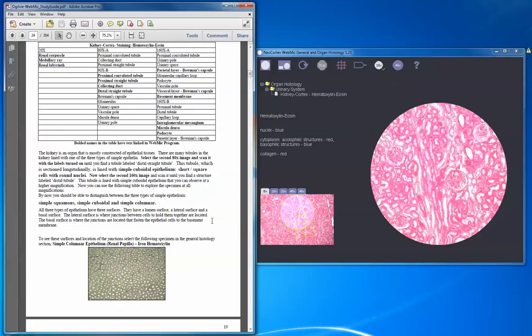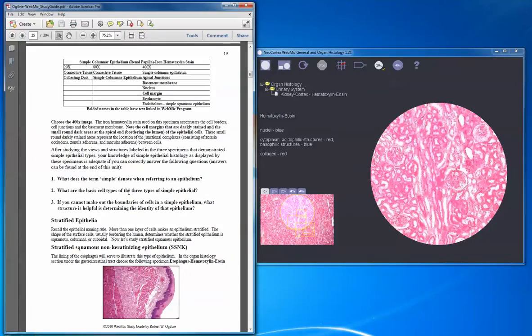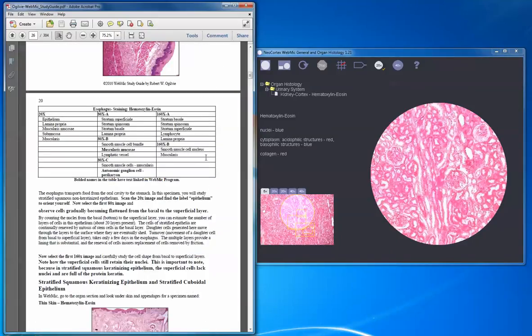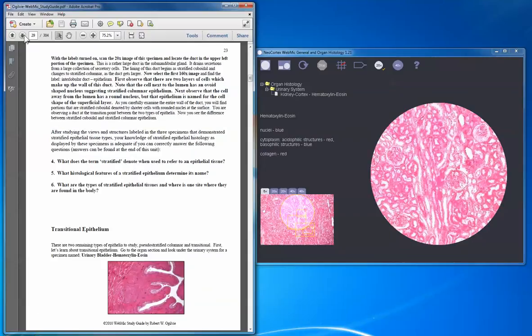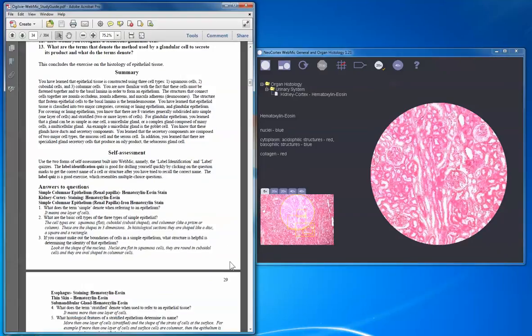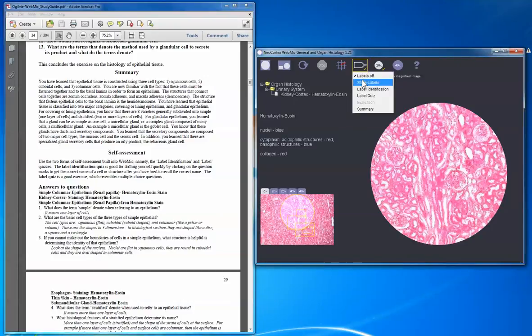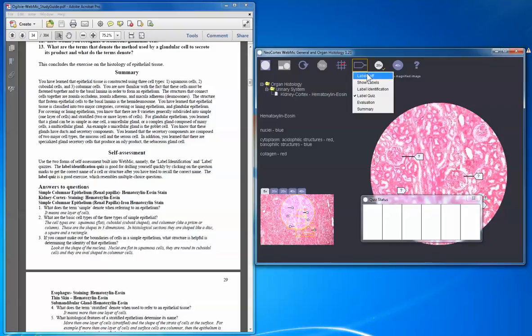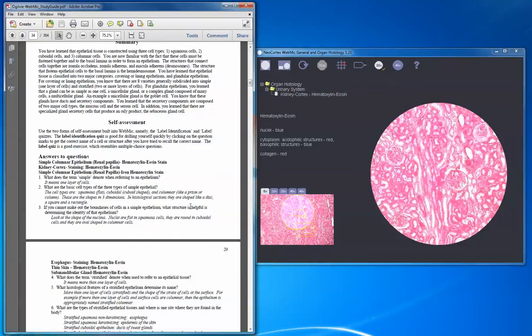After looking at several specimens, you have questions — for example, what does the term 'simple' denote when referring to epithelium? It denotes one layer. That's one of the concepts you need to learn by combining what you learn in lecture with what you're learning in the WebMIC study guide. That pattern is repeated throughout, with more questions appearing. At the very end, you have another form of self-assessment with answers provided. For example: what does 'simple' denote? It means one layer of cells.